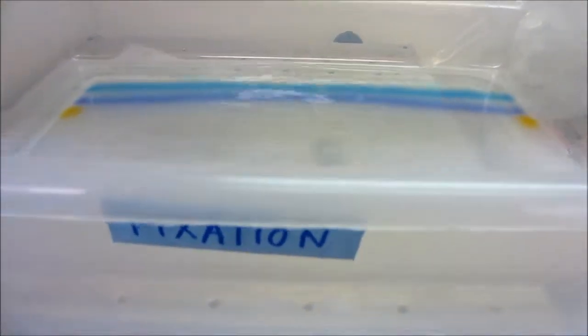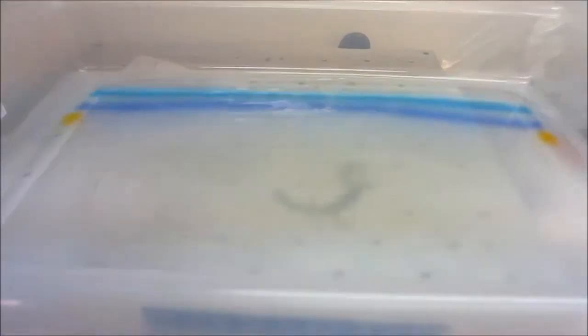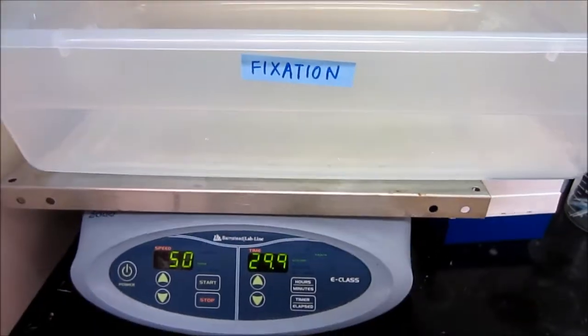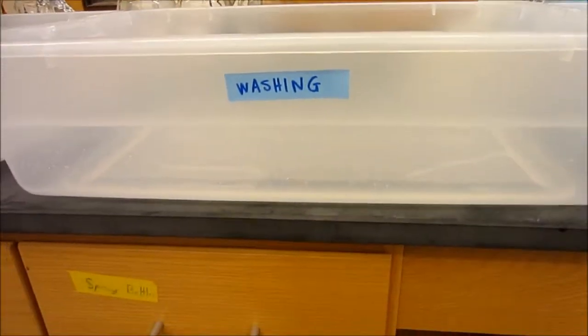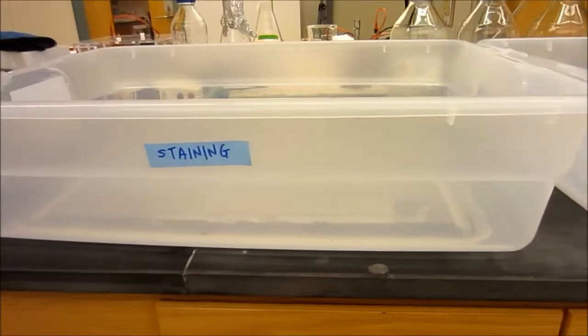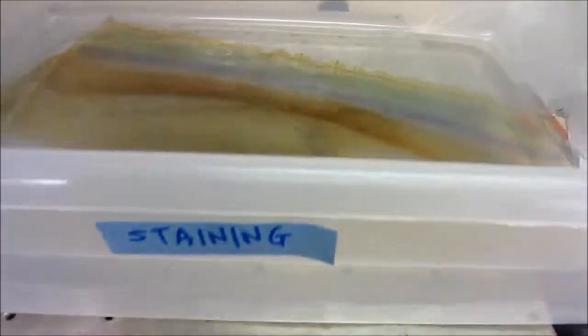The first step in staining is to immerse the gel in cool fixation solution for 5 minutes. After that, the gel is dipped in the impregnation solution for 3 minutes, then washed with distilled water, and finally immersed into staining solution until bands are visible.